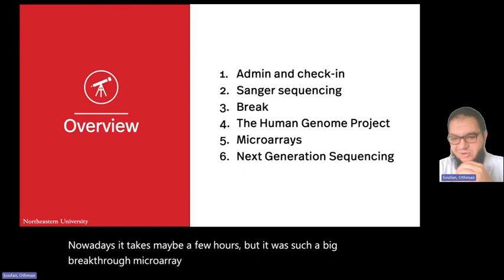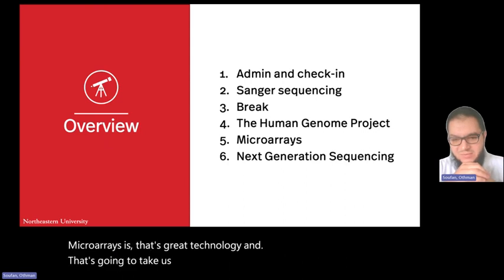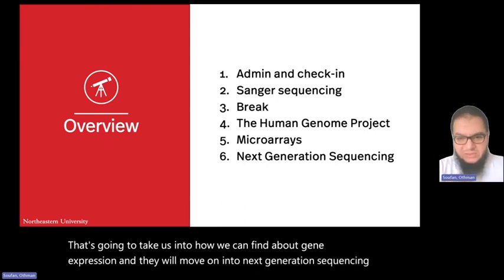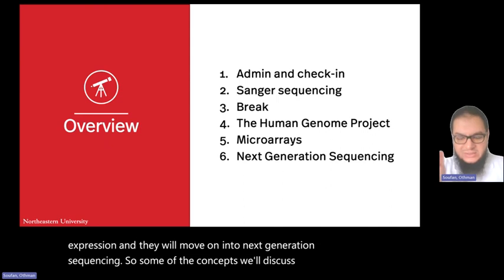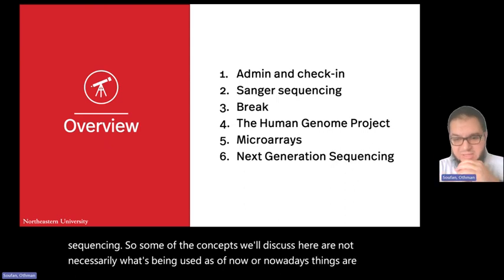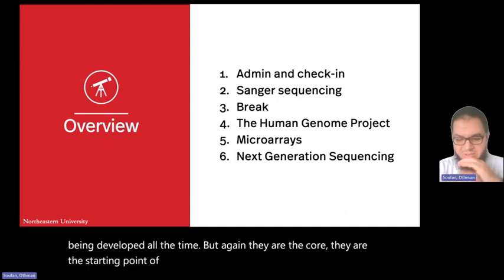Microarrays, that's great technology, and that's going to take us into how we can find out about gene expression, and then we'll move on into next generation sequencing. Some of the concepts we'll discuss here are not necessarily what's being used nowadays. Things are being developed all the time, but again, they are the core. They are the starting point of many of the things happening.